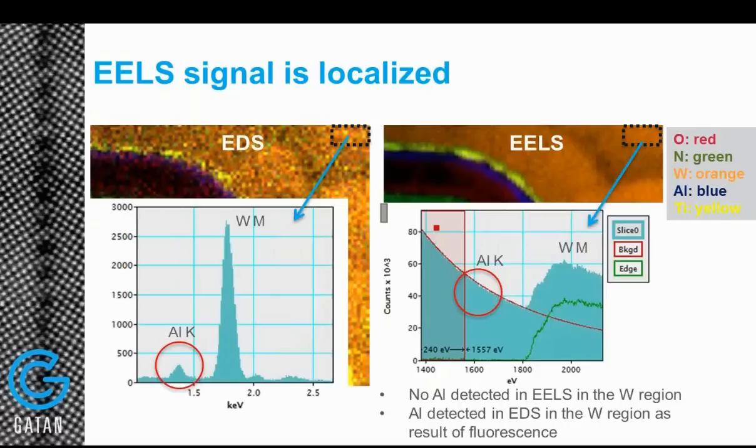Well, that's great. So I think we have time for one more quick question. Actually, we had a question, which software was actually used to analyze the EELS and the EDS data? Was this Digital Micrograph or were you using a third-party software?